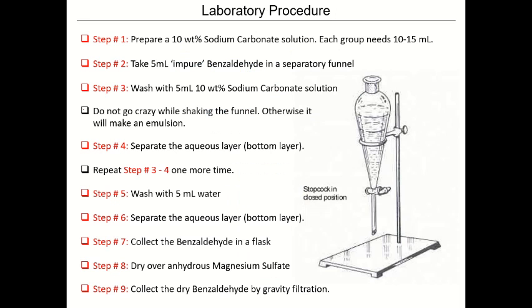So again, before we finish, we get an organic solution of benzaldehyde, right? Then we mix it with an aqueous solution that contains sodium carbonate. We shake it. We remove the aqueous phase from the funnel. We keep the organic phase. Then we do this step 2 or 3 times.